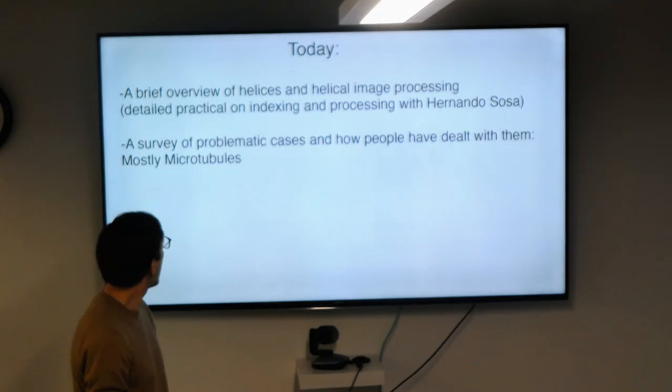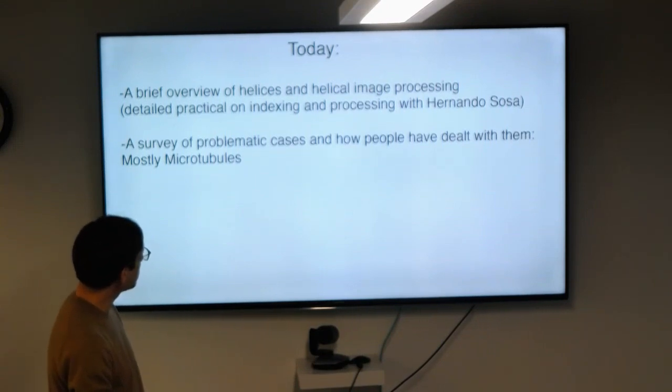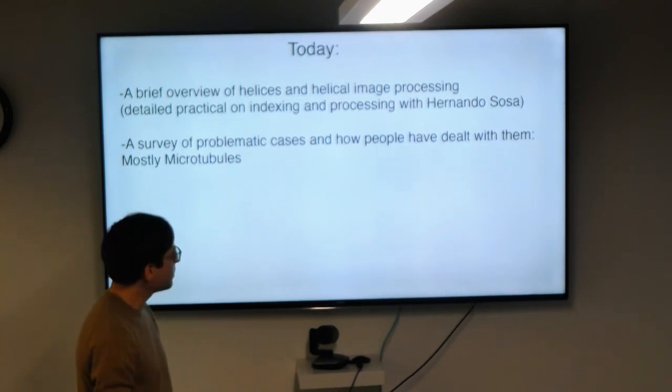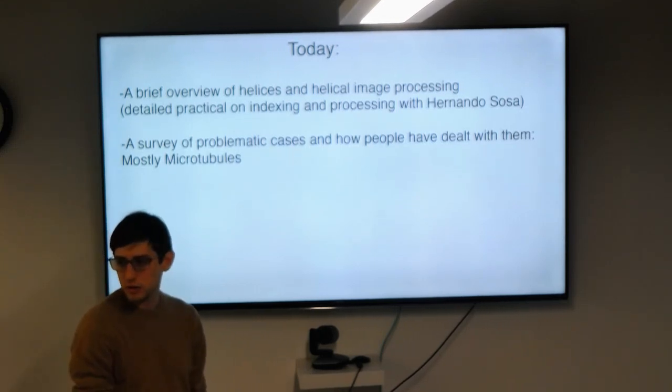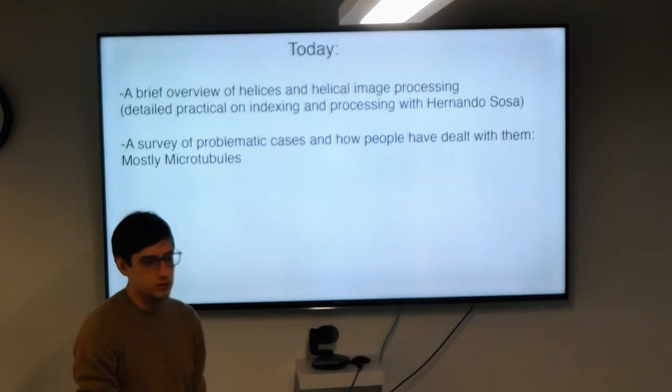And then the second half of the talk, I wanted to get into just a survey of problematic cases, I'll call them, or challenging cases in the history of helical processing, and how people have dealt with them. I'm not going to go into too much depth in any of them, but I put references in the slides that you can refer to if you ever encounter a similar case in your own studies, and so that will be a good starting point for figuring out how to deal with those challenges.